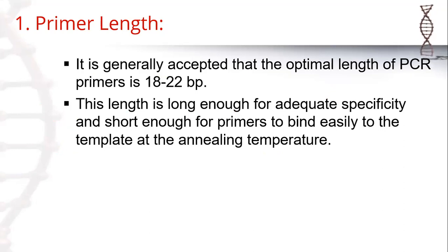The first are the tricks and guidelines for good primers. You have to know about this one. The first is primer length. If you don't know how to design a primer, the first question that arises in your mind is what length the primer should be.